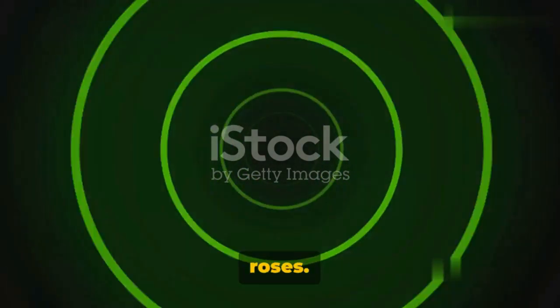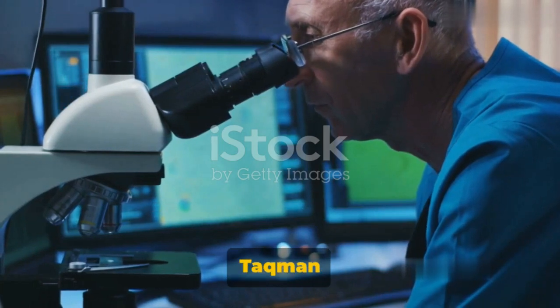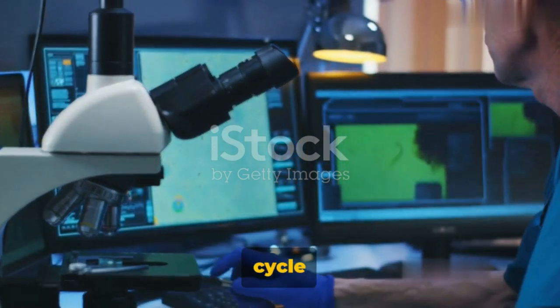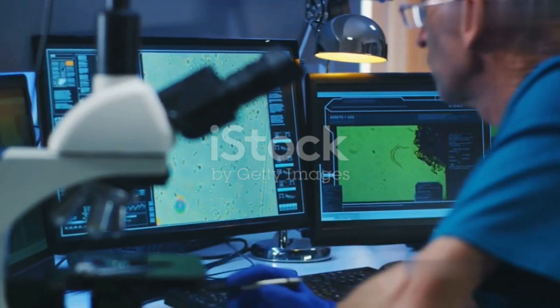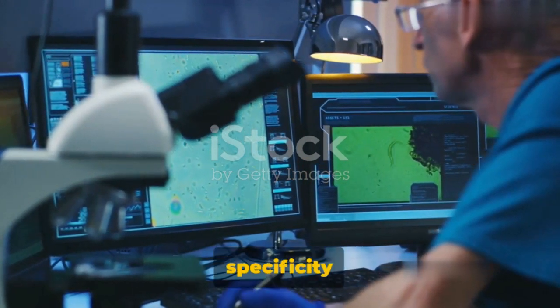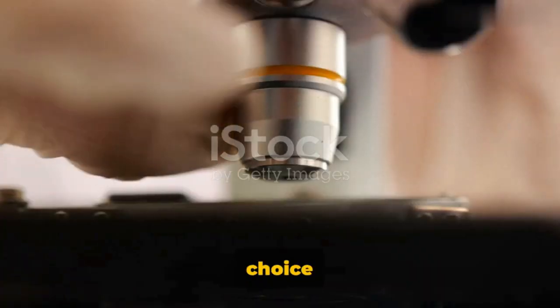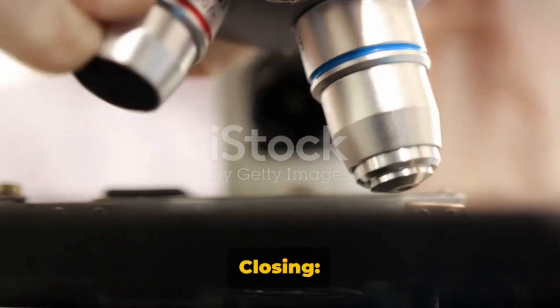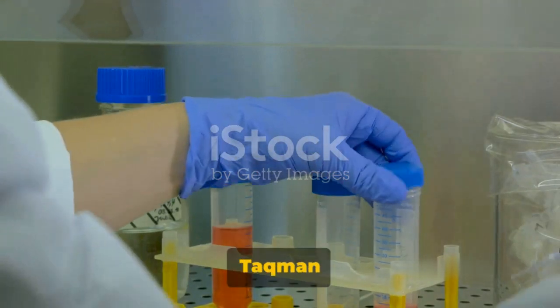But it's not all roses. One downside of the TaqMan probe is its inability to provide information about each amplification cycle or the melting temperature. Nevertheless, its specificity makes it a popular choice in the world of real-time PCR. That's a wrap on TaqMan probes.